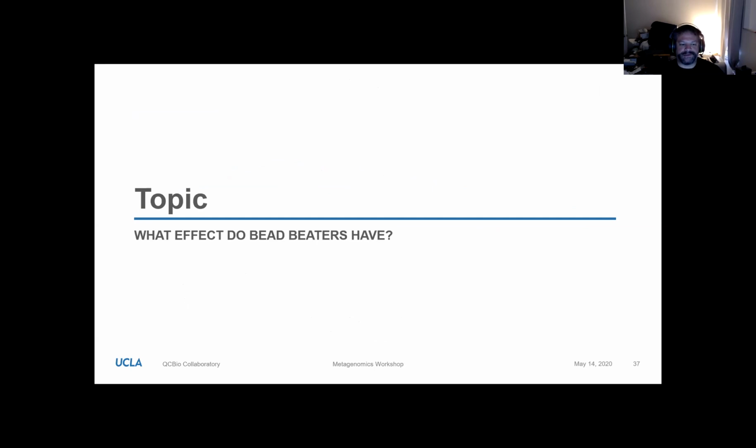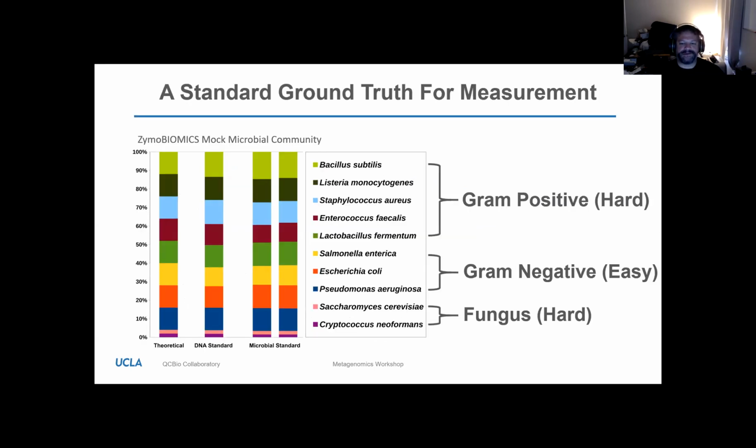So this is something Zymo definitely doesn't make. We do not make bead beaters. So I talk a little bit more freely about different brands on this one, although I'm just showing some examples here. So again, going back, we have a standard, which means we have some expected values to work with.